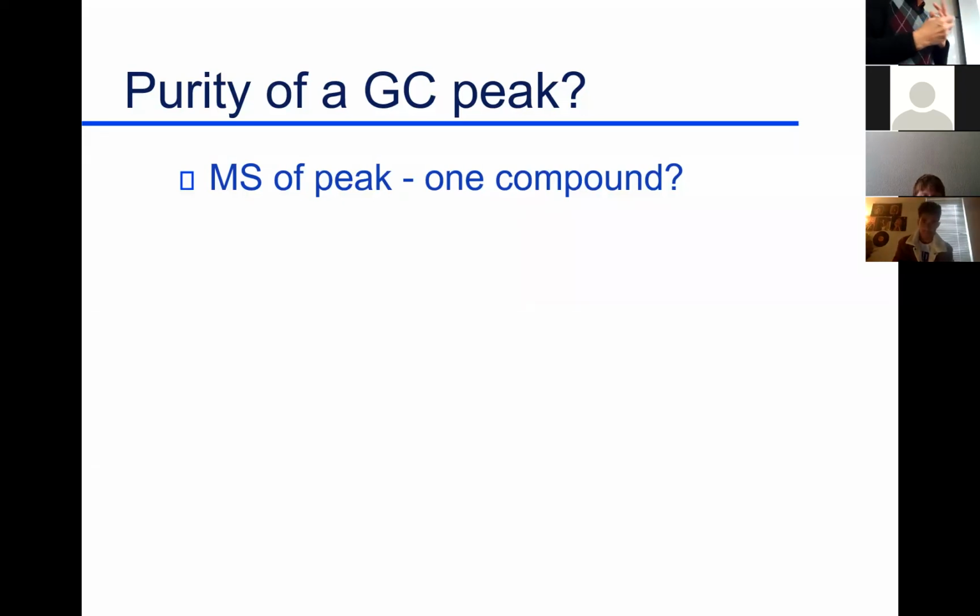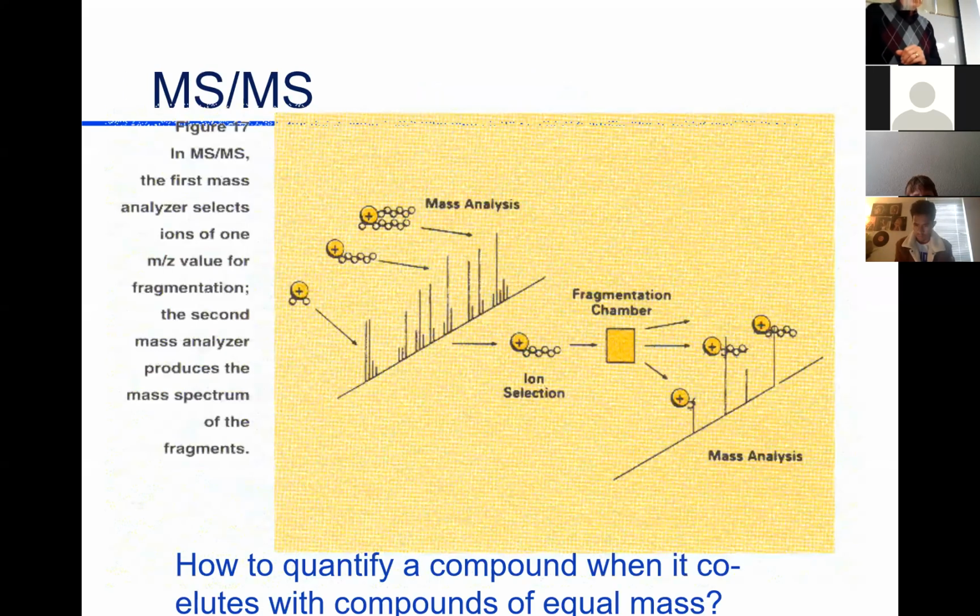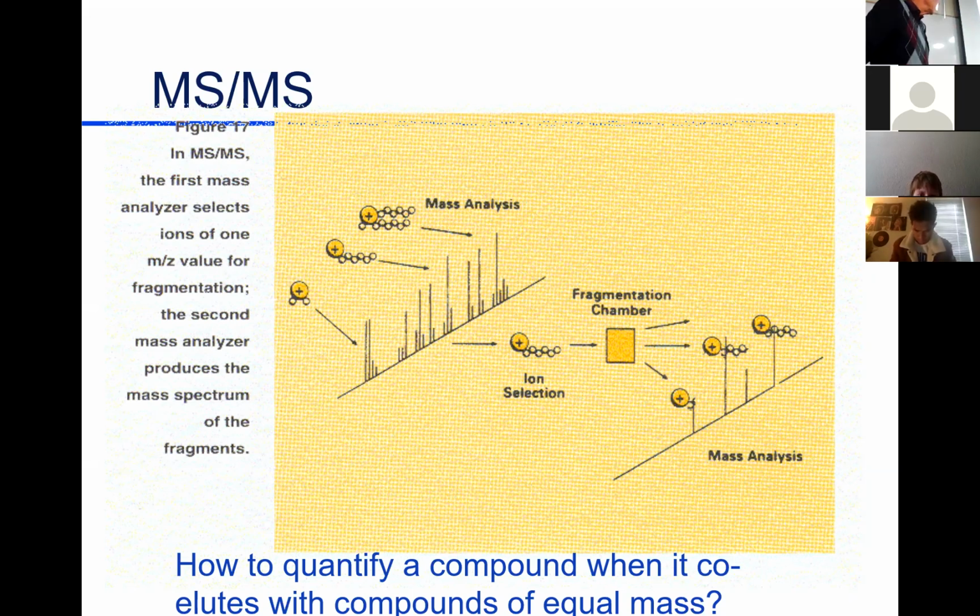You might be doing detection or limits of some carcinogen in food. And if you don't know what you're measuring and you're measuring only that, you could be in big trouble. So you really like to use mass spectrometry to say, this is it, I measured it, and that's all I measured. So in that case, what you do is you run your mass spectrometer across each peak and see that the spectrum, the pattern, is only for that compound and only that compound.